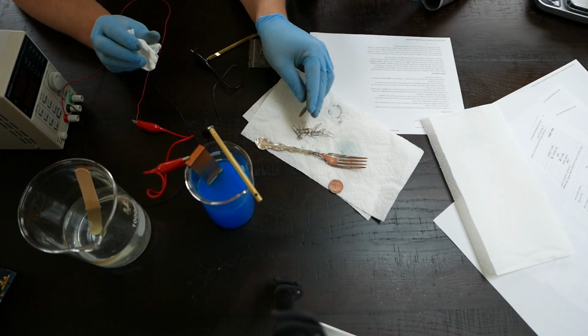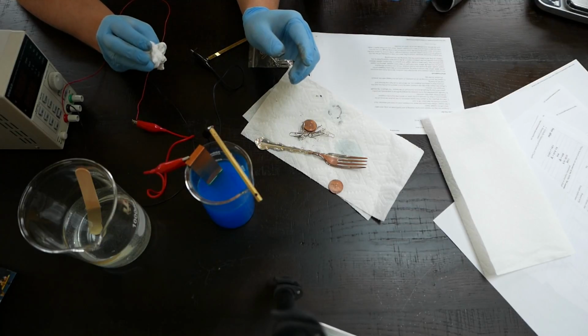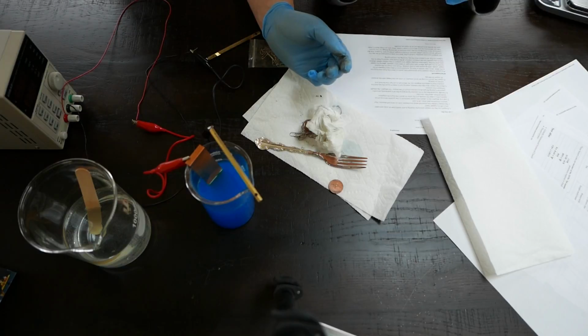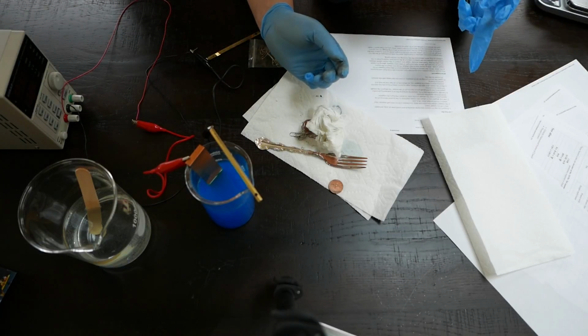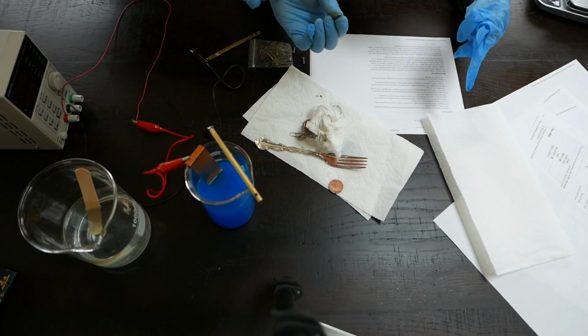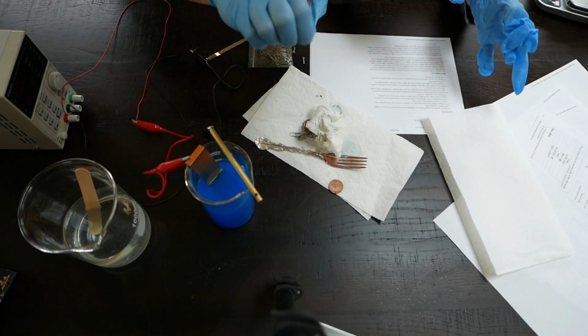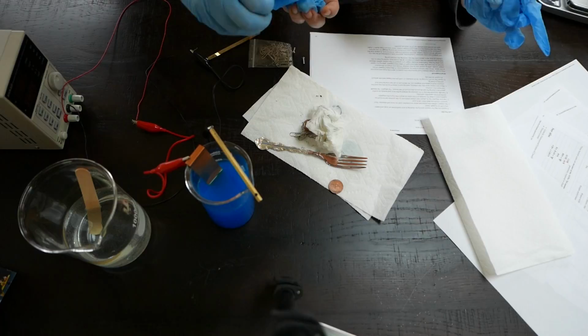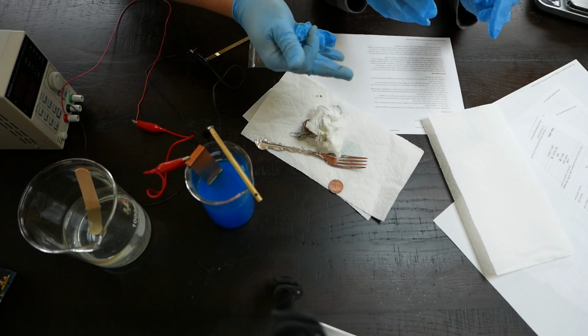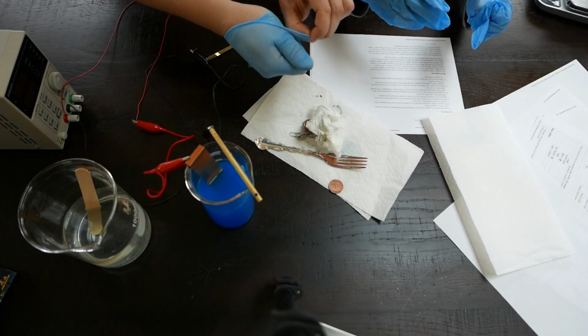All right, I will help you do it. You going to say goodbye before you do that? Bye. Okay, did I tell you how to do this now? Grab something on the inside, get your fingers on the inside, and then pull the gloves like this. Watch. All that junk that was in it is now inside the glove. Got it? Then you grab your other glove, your bad glove, and go like that.